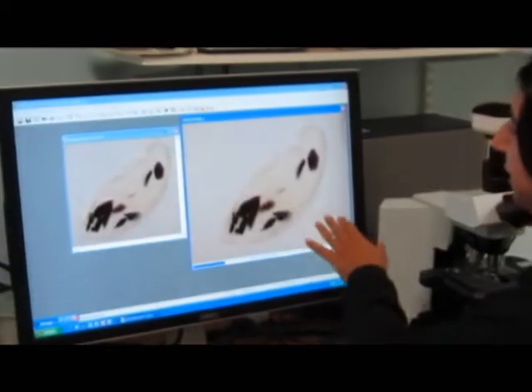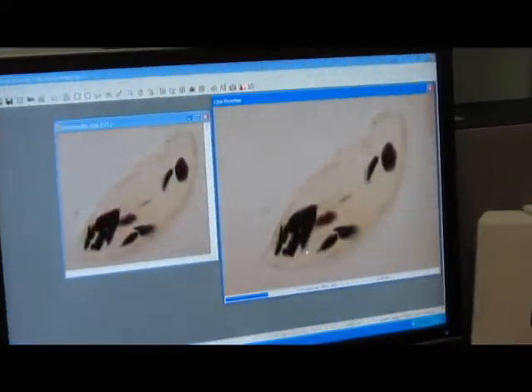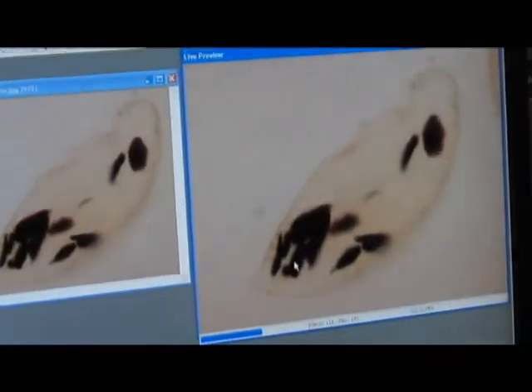This is the live view of the banana cell. All these purple things are the amyloplasts — some are small, some are bigger. The cells often have a banana shape to them.